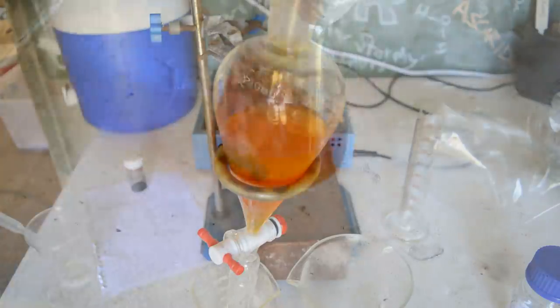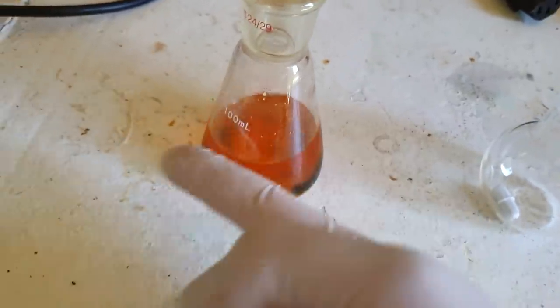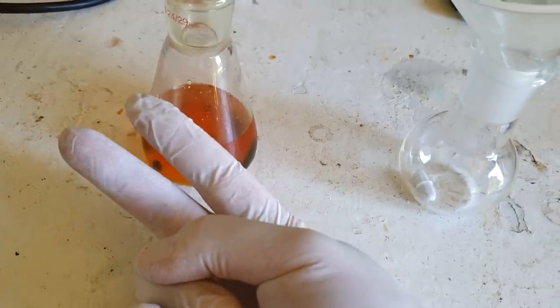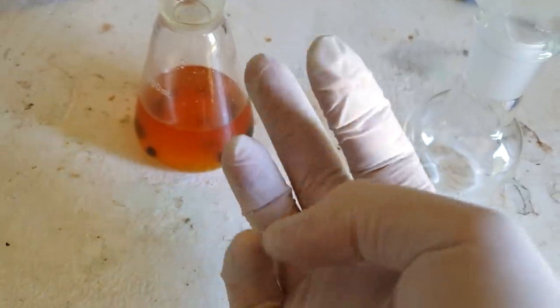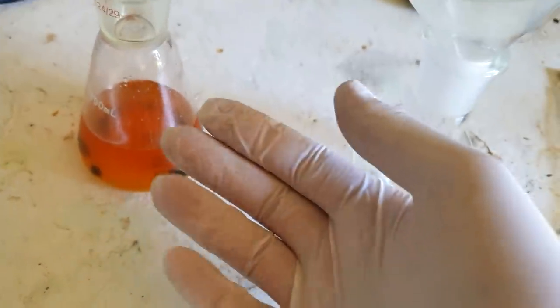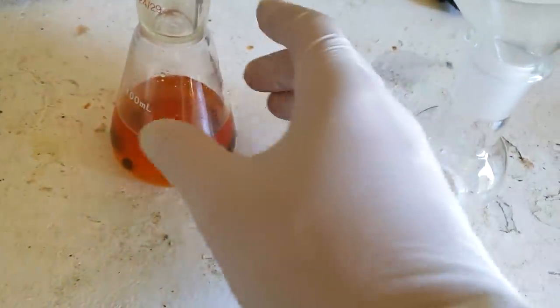Here is our DCM solution. It's noticeably dense. Even for DCM, it's very heavy, which is a good sign because our brominated product should be pretty heavy because those bromines are heavy. In here, we have our dichloromethane. We have our dioxane, which apparently isn't really removed in the water washes because it dissolves so well in DCM. Any unreacted ketal, we have the monobrominated, the dibrominated, and the tribrominated. Hopefully, given the length of the reaction, most of the brominated ones are the tribromo. We don't have too much of the di or the monobrominated one.